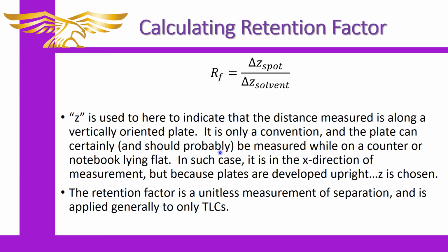The difference being that when you actually measure the plate, you will measure in the x direction typically, since most people want to measure on a flat surface. This, however, does not affect the measurement. All it is here to do is demonstrate convention and demonstrate that it's the distance that we're measuring on the plate.